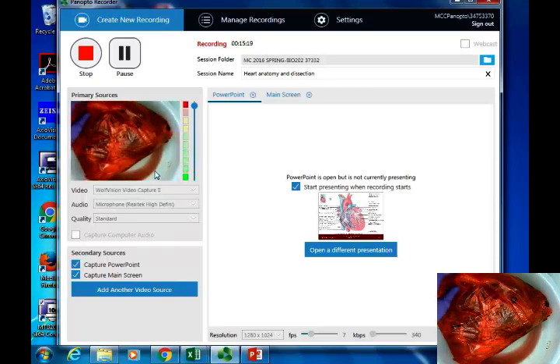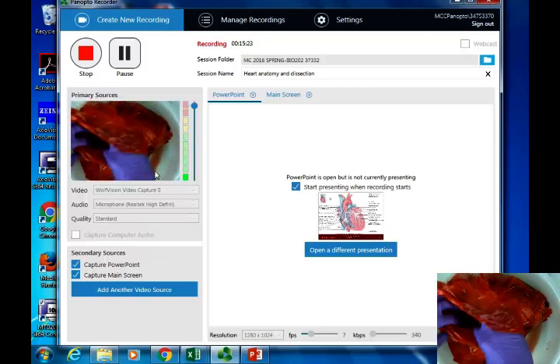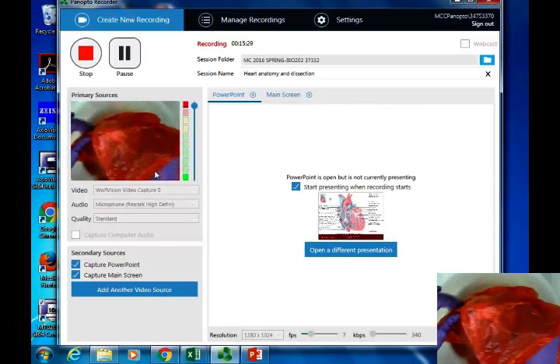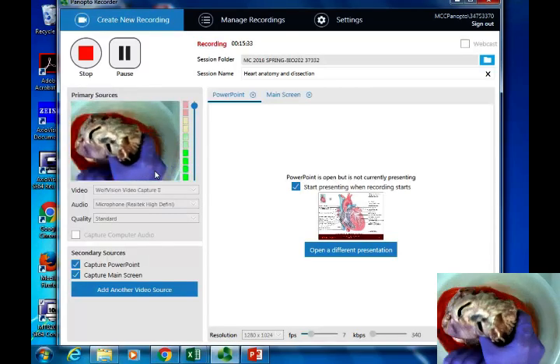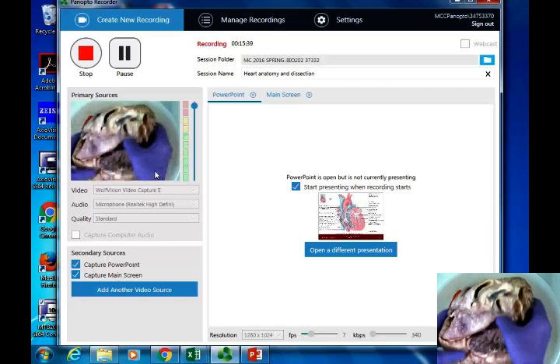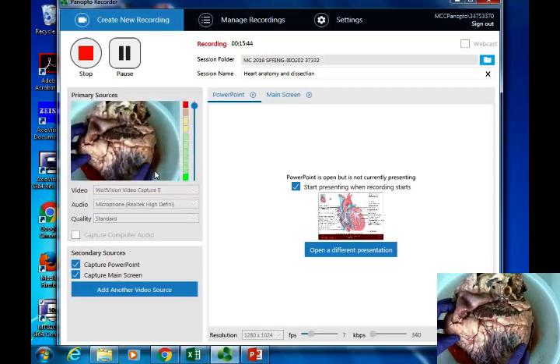All right, so, you know, cows have those big brown eyes. They're so sweet looking. You can see they have really big hearts. Right in time for Valentine's Day. If you want one of these for your boyfriend or girlfriend, you can run over to the butcher and say, oh, look, I heart you, honey. There you go.